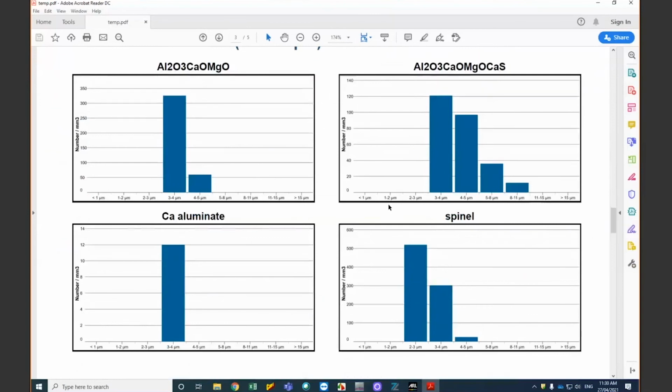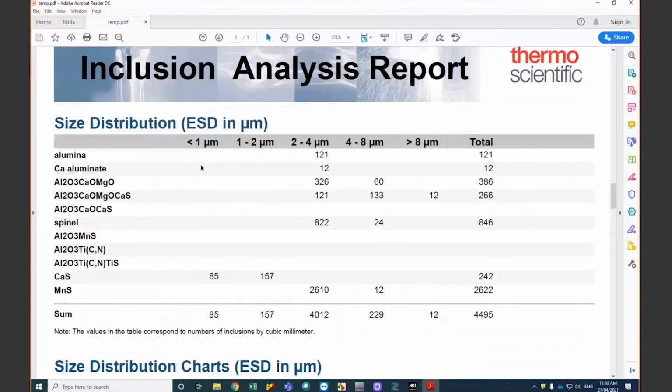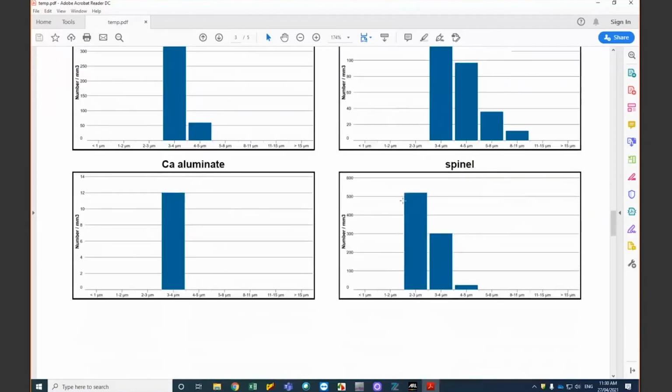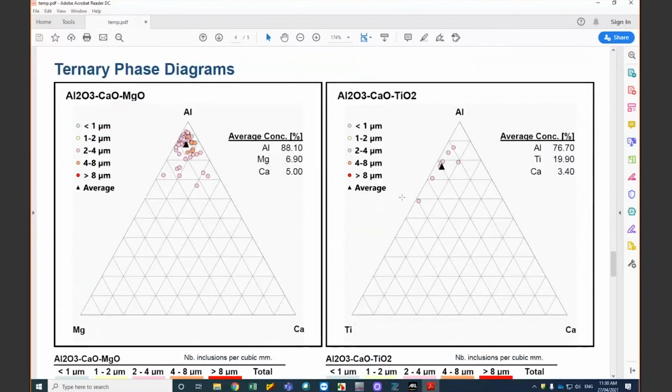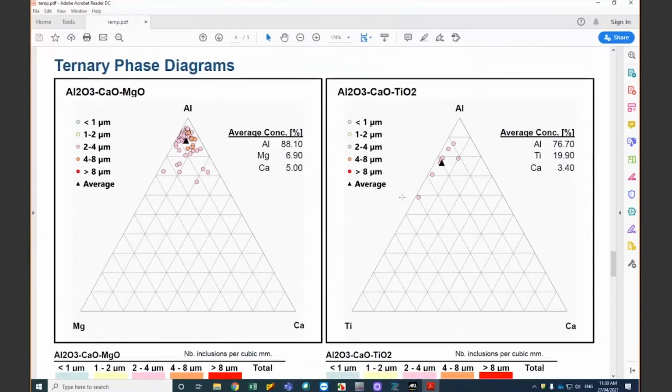And you can see, in order to show a nice plot, actually for the groups of the size discrimination, I have a different setup from here. So that's something, as you can see, that is flexible. Then afterwards, you have the possibility to have a ternary diagram. That is when you have the additional option of the report. That's called the TD option for the report.